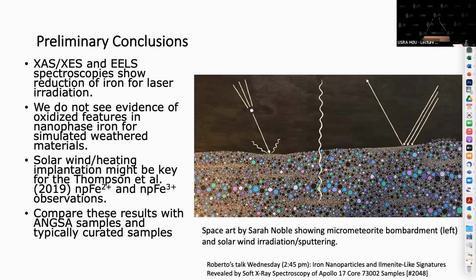Okay, cool. And then just as a note for the 532 peak, we see that appear in EELS, and it's usually associated with molecular oxygen, but also O-O bonds, which is consistent with reduction of other things that are there. But we see a peak like that appear in EELS for a lot of space weathered materials. Okay, cool. Thank you for pointing that out.